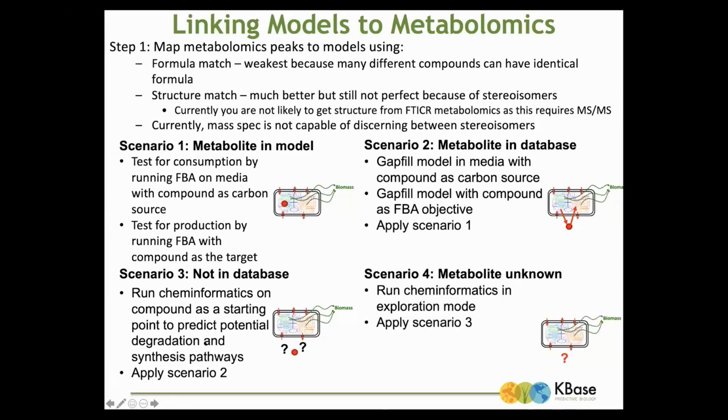But also scenario 4, which unfortunately with FTICR, this is where you're at the moment. You have a formula, you don't actually have a structure. So it's sort of this hypothetical thing. But again, the cheminformatics offers a mechanism to get at those formula with a mechanistic basis.